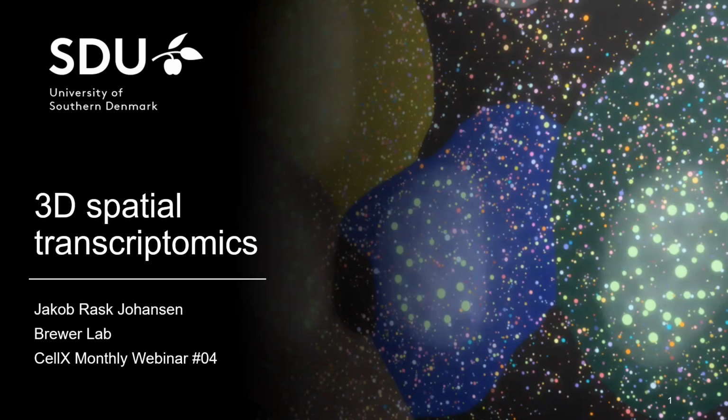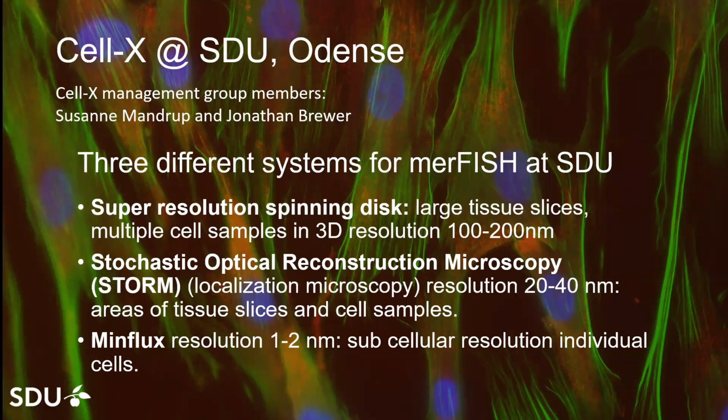As he said, I'm going to be talking a bit about this 3D spatial transcriptomics, which we are working on here at SDU in Odense. So first up, the CellX node here in Odense: the CellX management group members are Susanne Mandrup and Jonathan Brewer and their groups here. And we are working on making these different systems for a technique called MERFISH, which I will talk a bit about later.